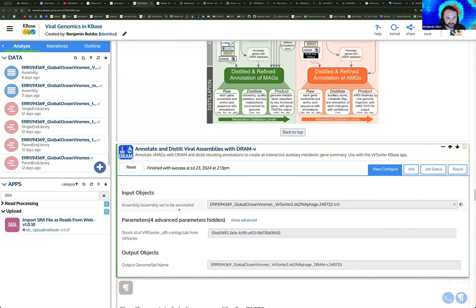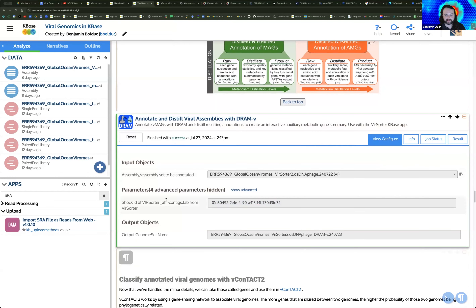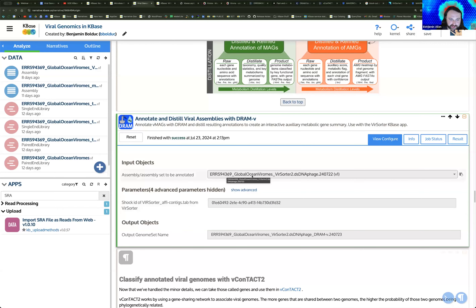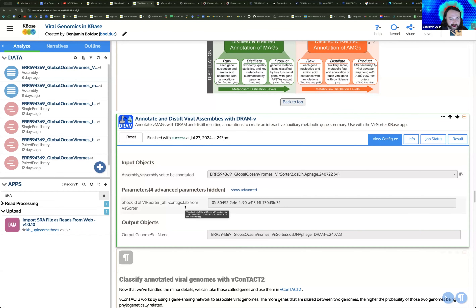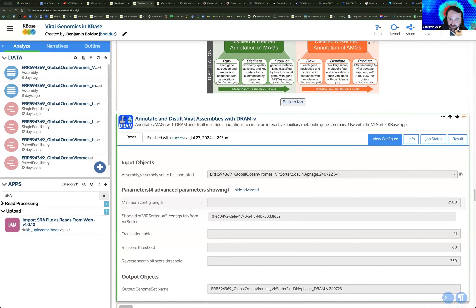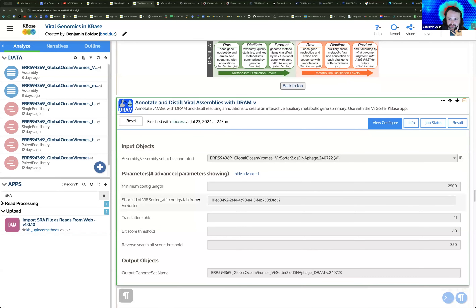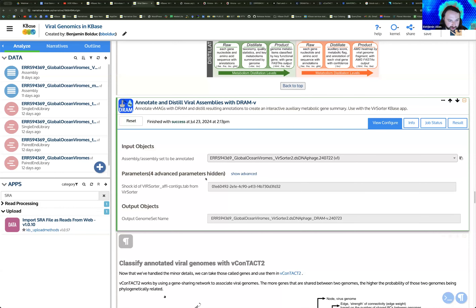This is an example diagram from the DRAM paper showing how it calls genes and references different databases to give you this distilled and refined annotation, as they call it. When you're plugging your inputs into DRAM-V on KBase, the reason we had to check that box in the previous app is specifically to get this Shock ID parameter. This will not work unless you pull this KBase-specific identifier. I'll jump back to VirSorter in a second to show you where to find that.